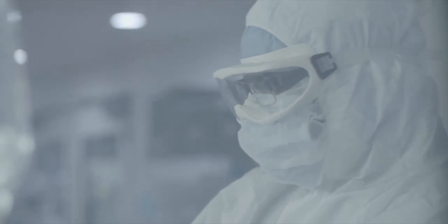From sterile IV preparations to hard-to-find ophthalmology compounds, SourceB is the premier resource for all of your 503B needs.